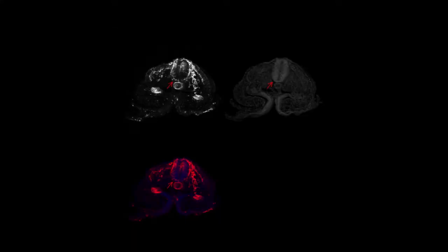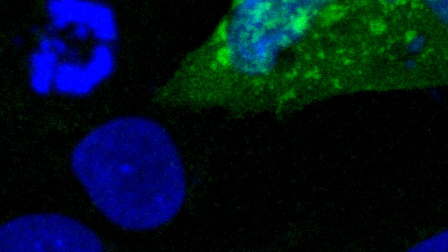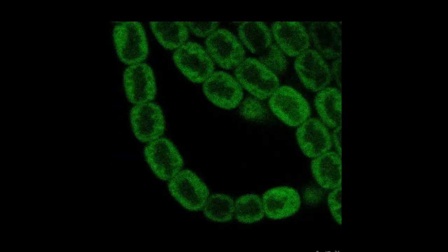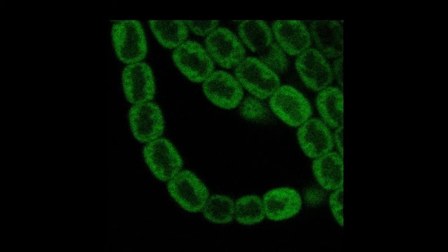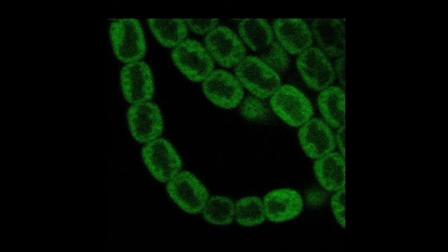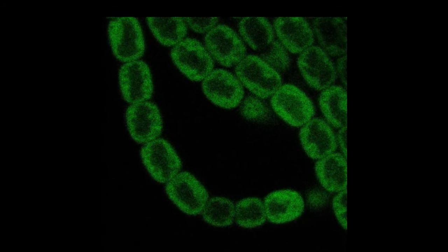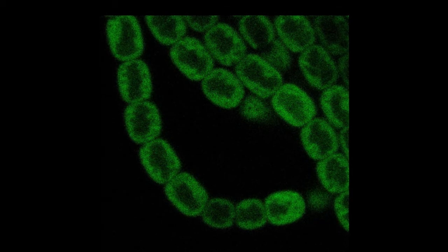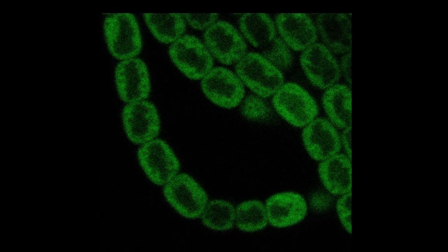So in this chapter we're going to go through a series of images that were taken with our own confocal microscope. This is a picture of a cyanobacterium taken by the Summers lab. The green is a sigma factor that was tagged with green fluorescent protein to show protein localization.